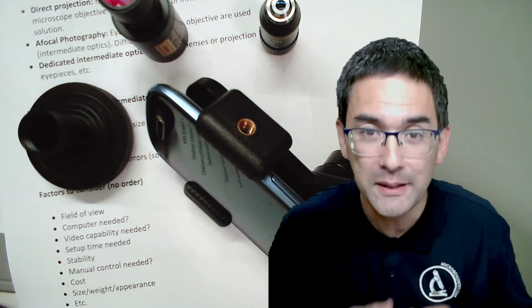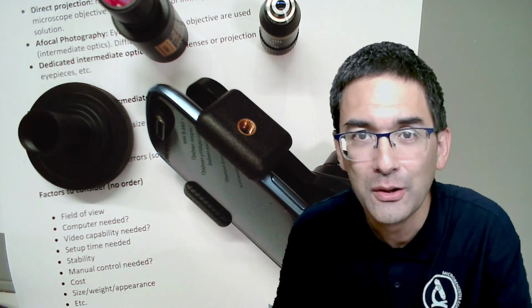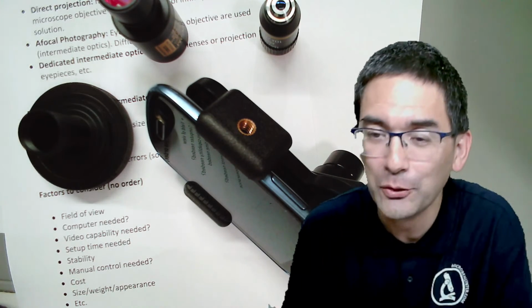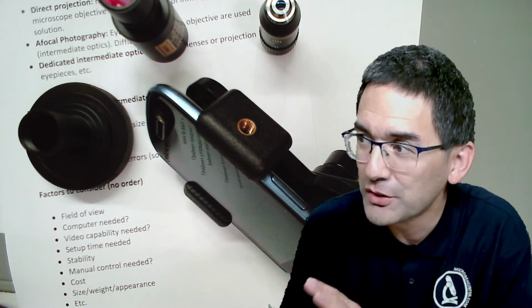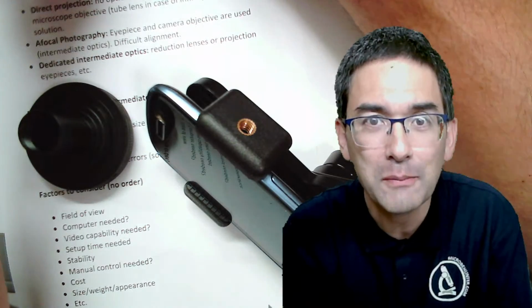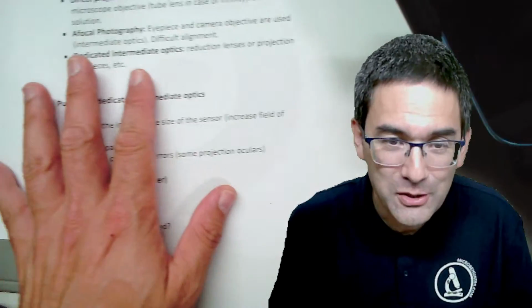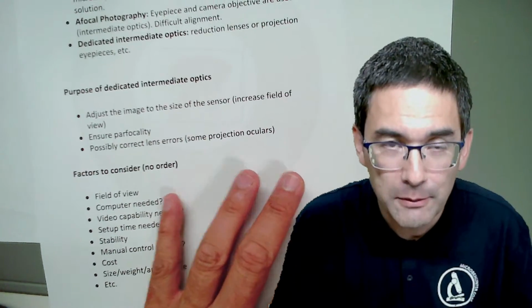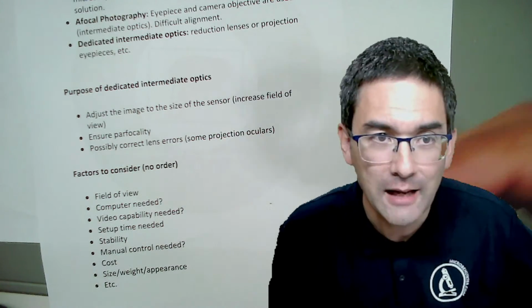I prepared quite a bit today, and I would like to demonstrate a few things, and I hope that it works. It's always this demonstration effect because the whole afternoon I've already been setting up everything, and because I've got so many cameras connected over USB, it kind of overloaded my USB port a little bit, but I think we'll be fine. So I just want to give you a short overview of what we're going to cover today before I actually go into the practical aspects, and we'll actually show you some of the things that I have here.